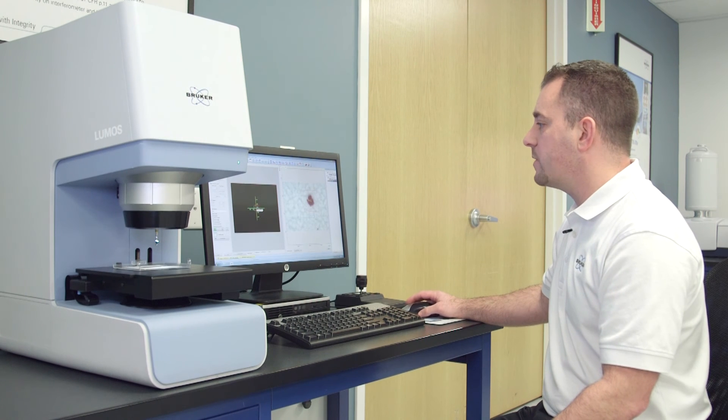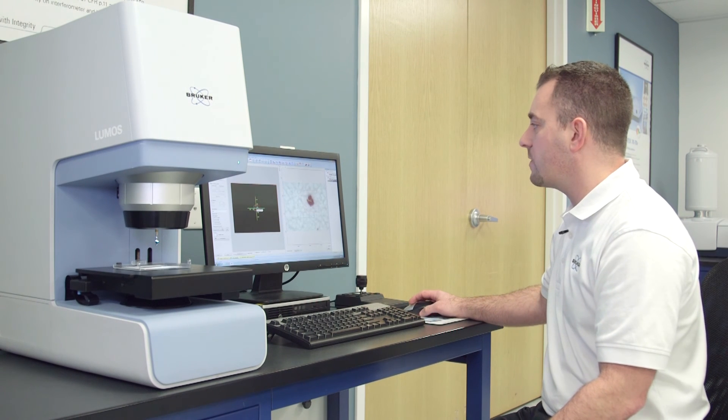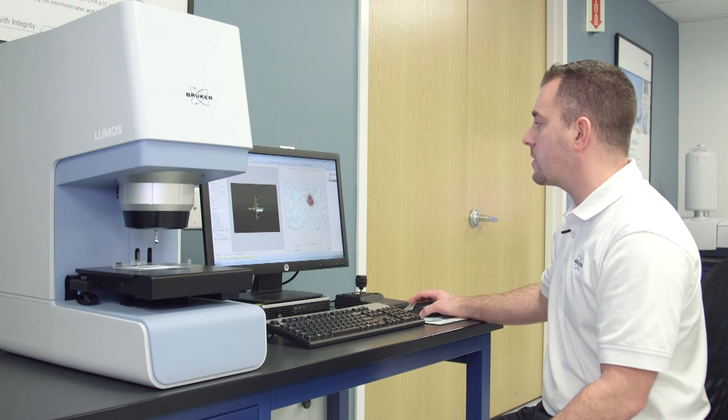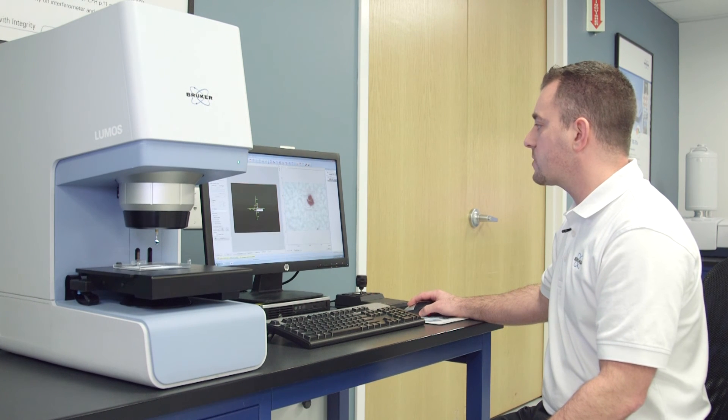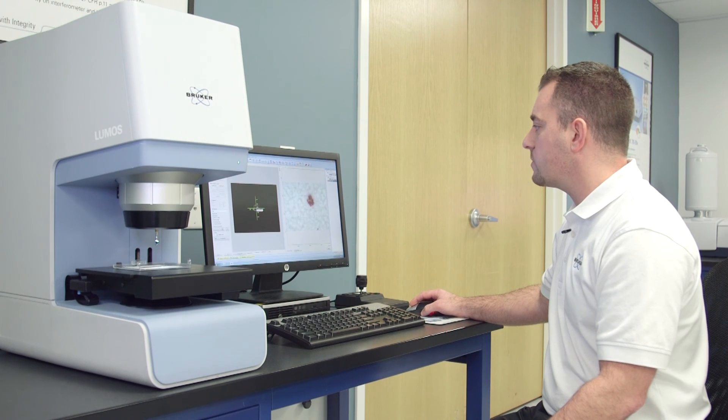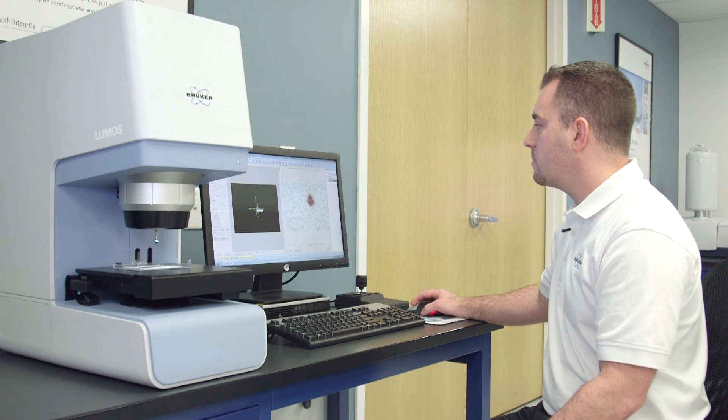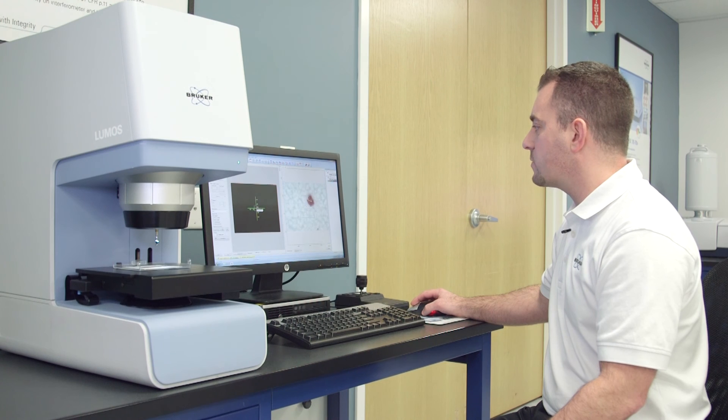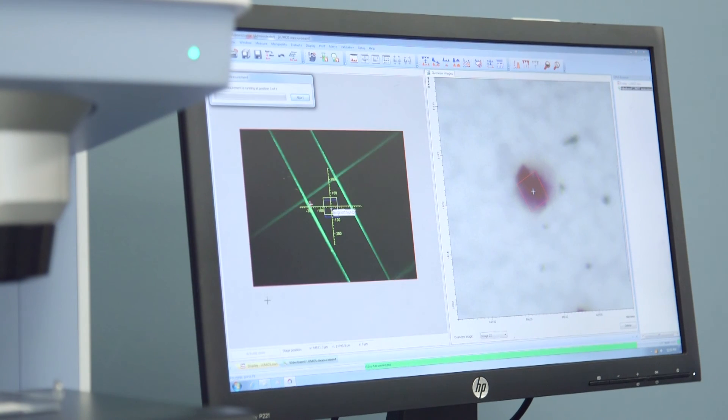Now my aperture is too big for my sample. My sample is a lot smaller than the 100 micron aperture that the ATR tip gives us. So I'm just going to close down my aperture a little bit. Rotate it so that I only see particle of interest and not the filter paper around it. Again, the aperture blades close down. They rotate into position. This time we're going to take a background according to that very well defined aperture I placed on our particle.